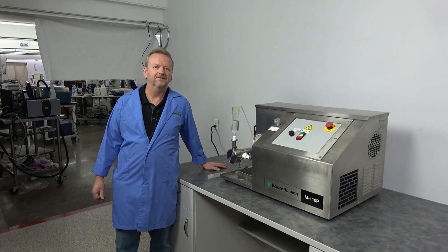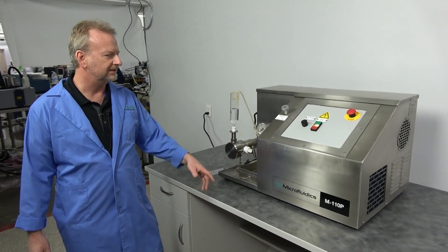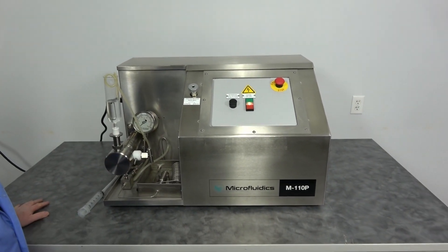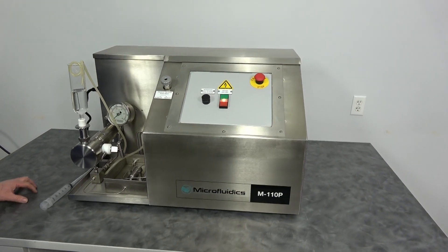Hi, I'm Rich at New Life Scientific, and today I'm going to show off this beautiful Microfluidics M110P. P is for the power unit. This one, unlike its predecessor, does not require air.